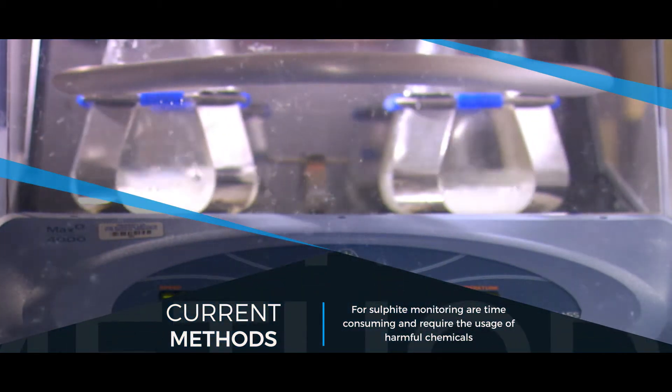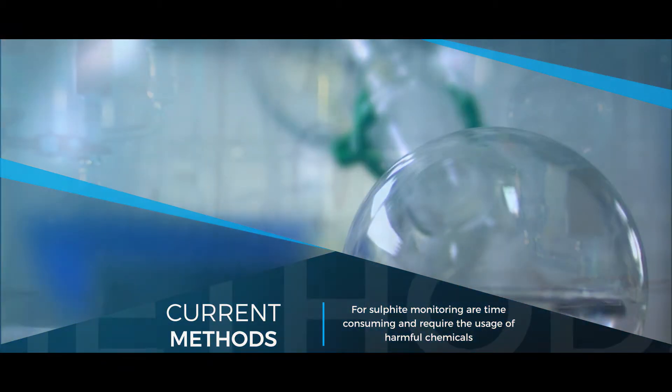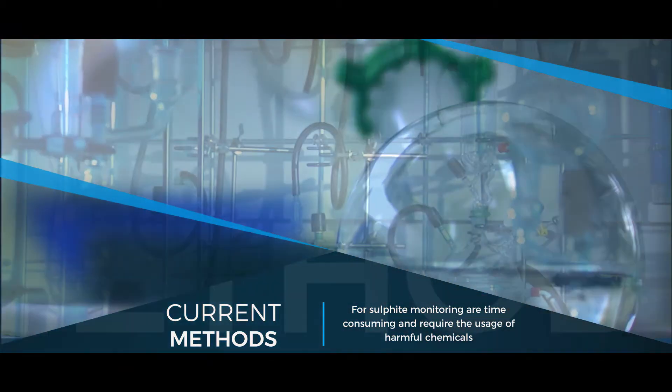The current methods used for sulfite monitoring, such as Monier-Williams, are time-consuming and require the usage of harmful chemicals.